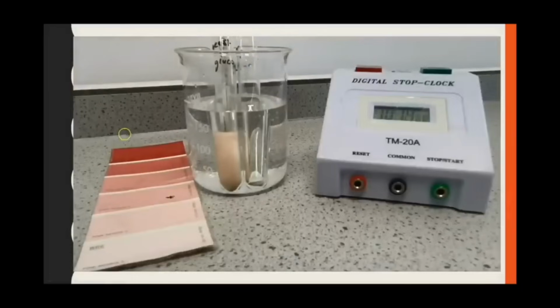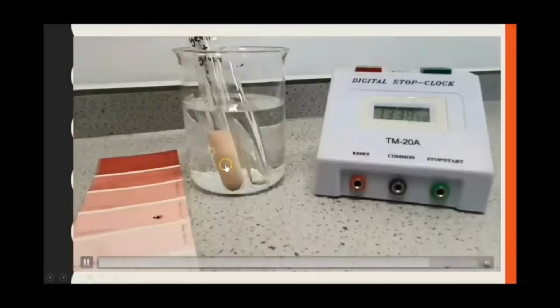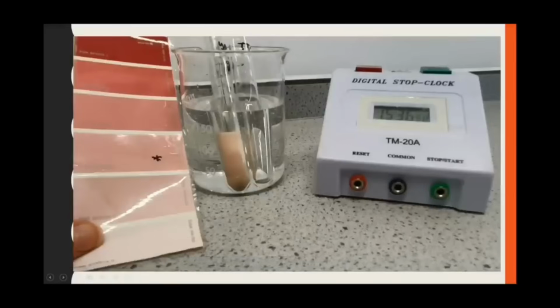I've also taken it out, you can see periodically, just to check against the colour sheet. And that's what you'll keep doing until you've decided that the colour of your solution has matched this. Now for me, as I said, I get to 15 minutes and it's not quite there. I'm going to show you what the final endpoint should look like.